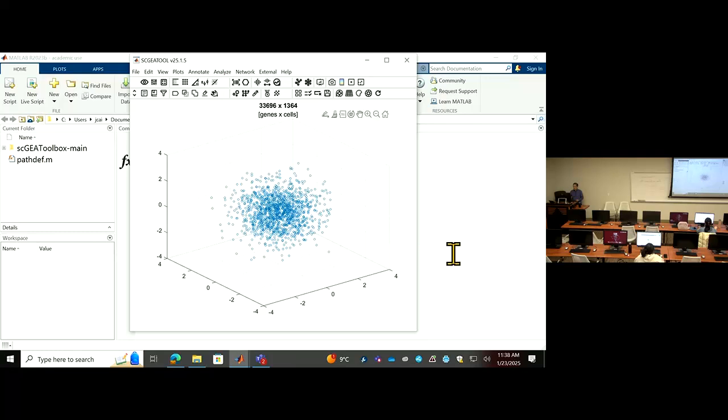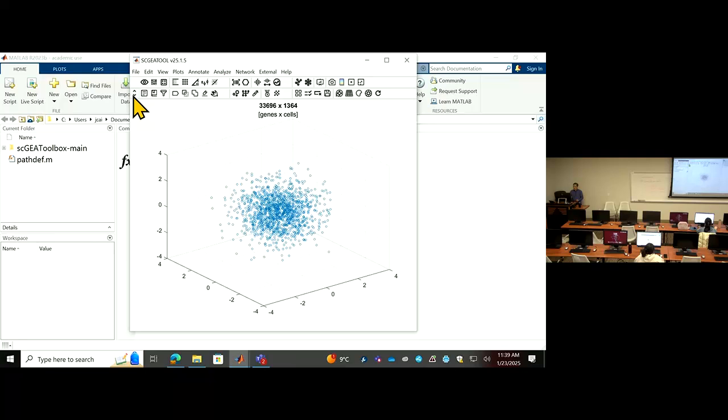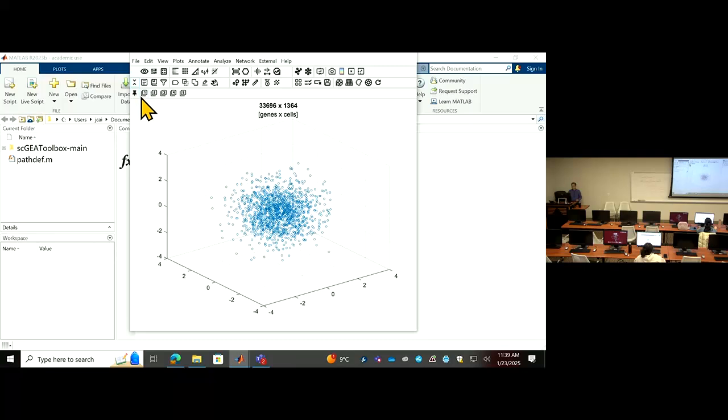On the top most left, if you click there, there are 1, 2, 3, 4, 5 buttons at the landing panel to show you which button you should click first. If you click number 1, this button will change to the button that you should click first.